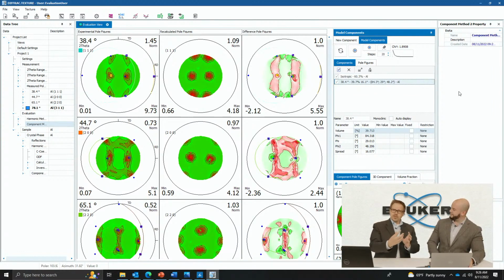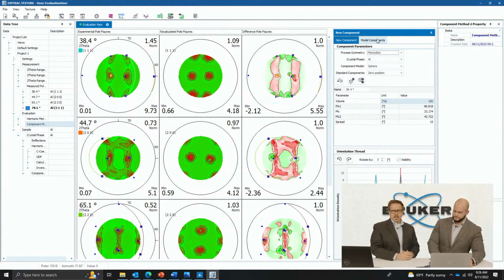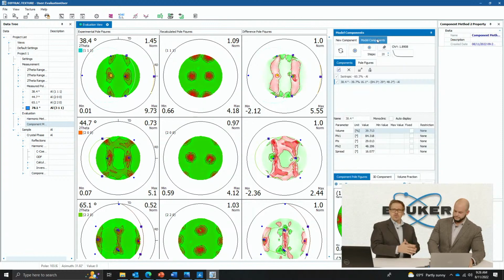And this is kind of like that single crystal one, but it has 3 different factors for each direction of broadening. So if you have things that are kind of oriented, but they have one direction or 2 directions that are meaningful, that'll help with those issues. Right now, the way you'd approach that is just to add multiple spherical components. So it looks like we're starting to build up that fit pretty well here.